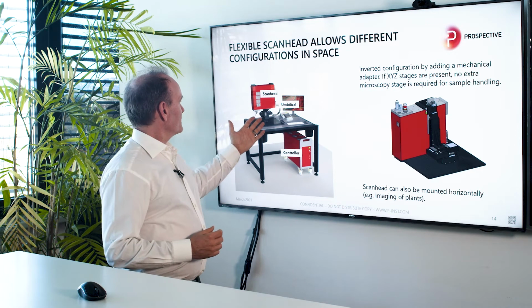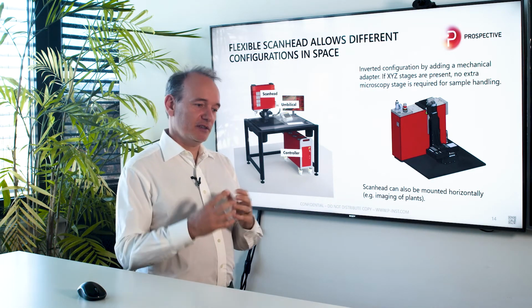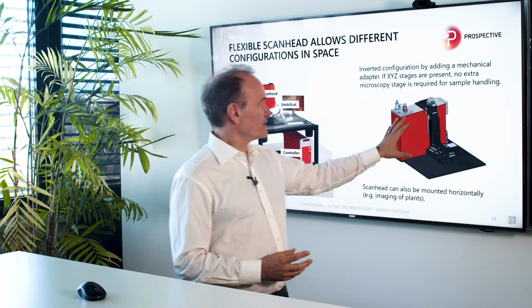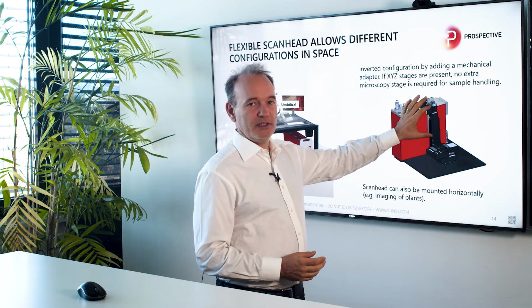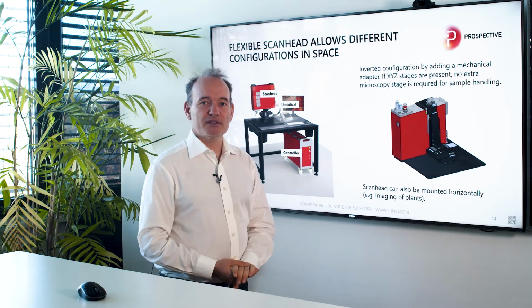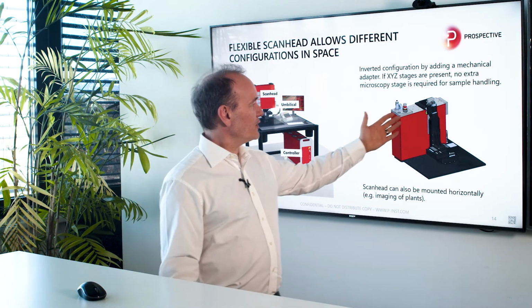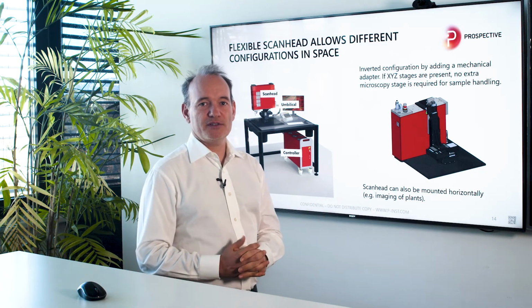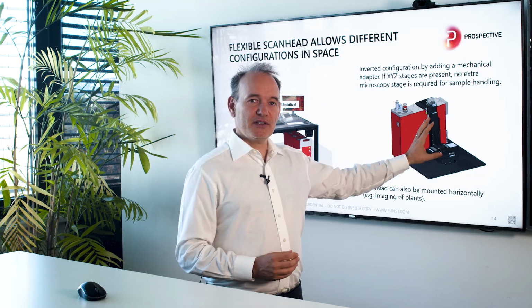Because, as I already mentioned, the scan head is connected to the controller with an umbilical, it's very easy to go from an upright configuration into an inverted configuration. You can see here a sketch of how the inverted configuration looks. Basically, you only need a mechanical adapter plate that turns the microscope upside down, and you can easily use it for any inverted experiment. Because it's still connected to the XYZ stages, you can also have the full travel of the XYZ stages.